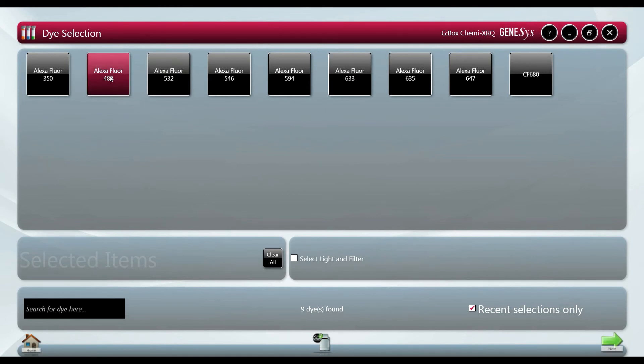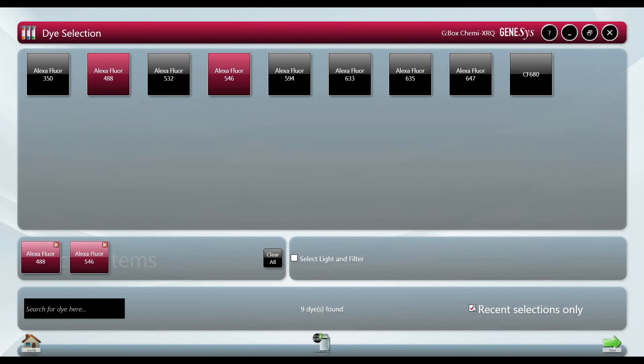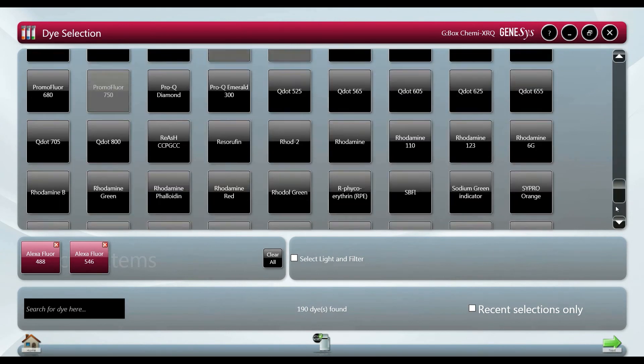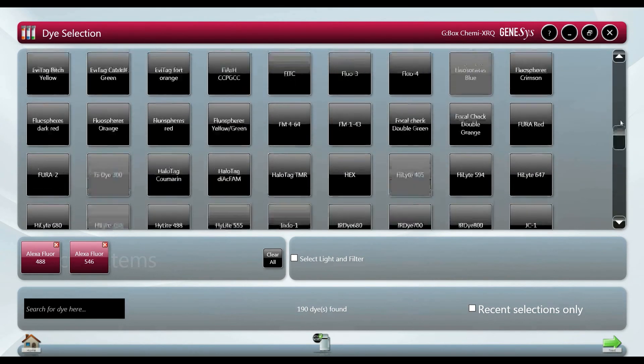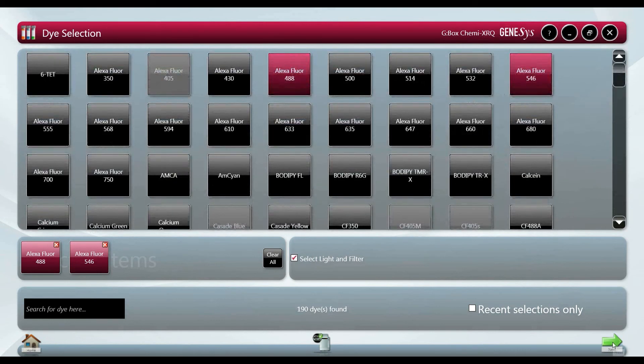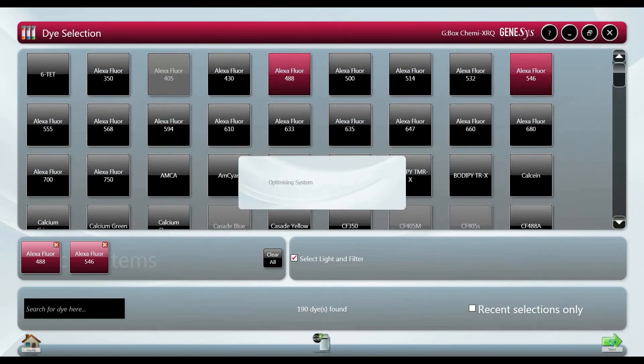The fluorophores used on the blot are chosen so that when you refer back to the images later at a later date the protocol is saved. This also ensures that optimal excitation sources and appropriate emission filters are used to give you the best possible image.